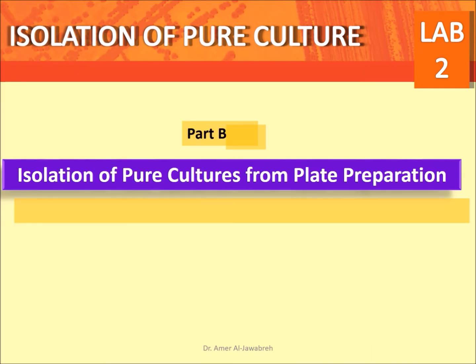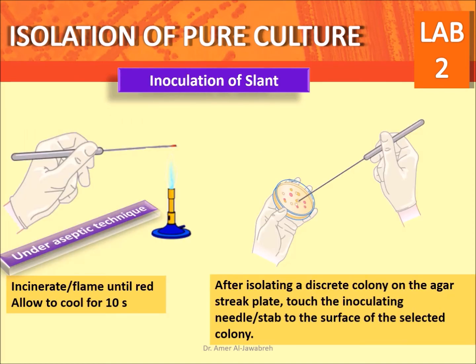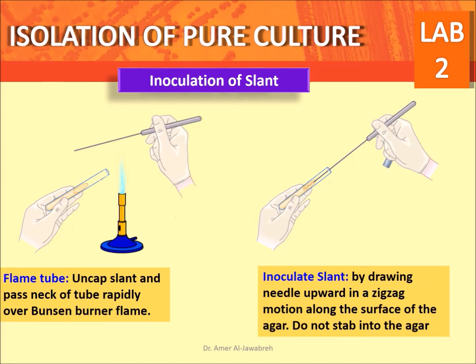Part B, isolation of pure cultures from plate preparation. Purpose: to produce a pure stock culture by subculturing from the culture plate. Inoculation of slant. First, incinerate until red. Allow to cool for 10 seconds. After isolating a discrete colony on the agar streak plate, touch the inoculating needle or stab to the surface of the selected colony. Flame the tube. Uncap the slant and pass the neck of the tube rapidly over the Bunsen burner flame.